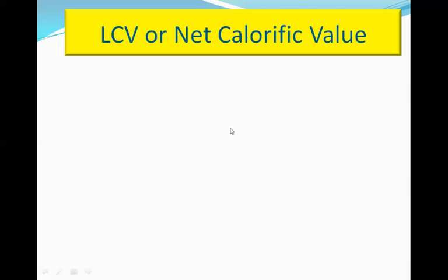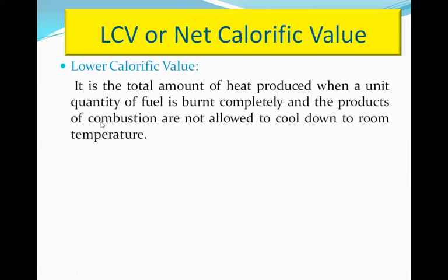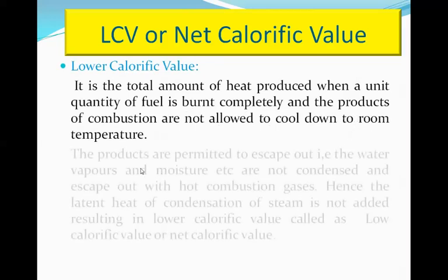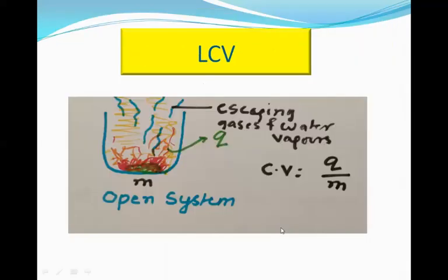LCV, or the net calorific value, is the total amount of heat produced when a unit quantity of fuel is burned completely and the products of combustion are not allowed to cool down to room temperature. The products are permitted to escape, and the water vapors and moisture are not condensed and escape out with the hot combustion gases. Hence, the latent heat of condensation of steam is not added and the value is lower, and is called the lower calorific value or the net calorific value.